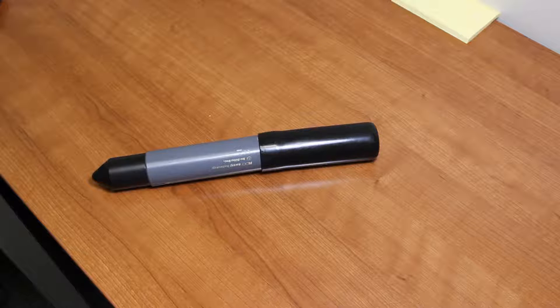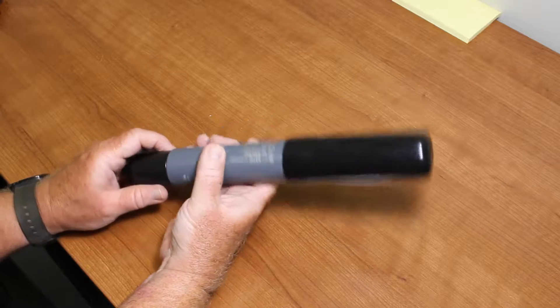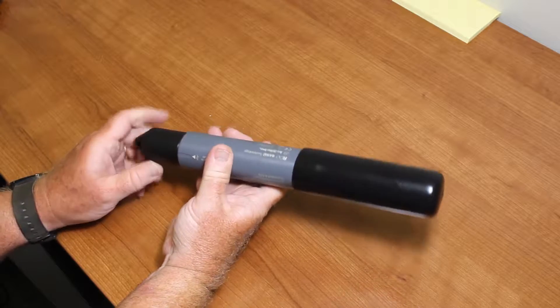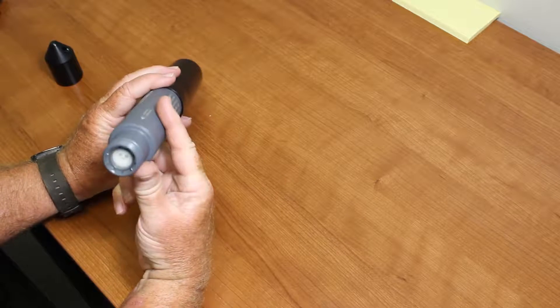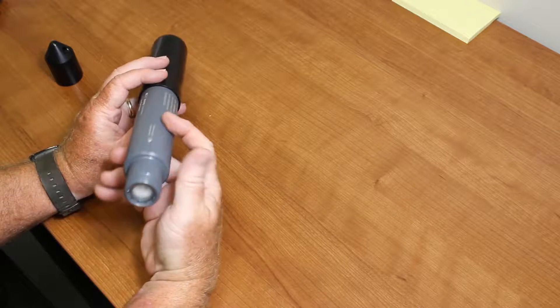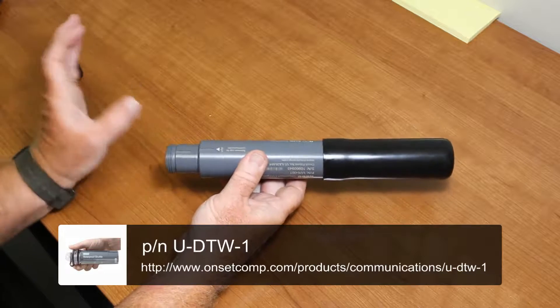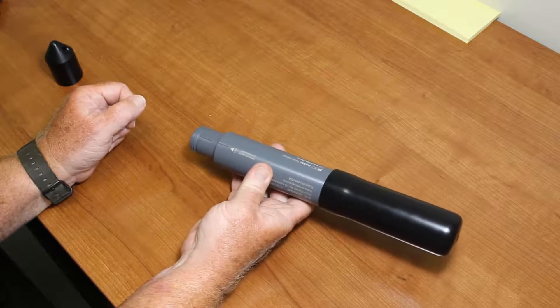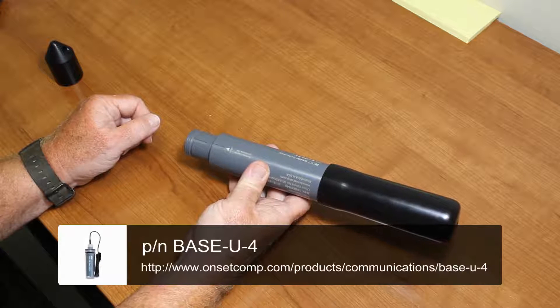The lab calibration routine is accessed with our HoboWare software — you can do it with the free version or HoboWare Pro. In order to communicate with this device, it uses low-power infrared LED communications, like most of our current water loggers. To access it with our base station or shuttle, we unscrew the protective cap. The infrared LEDs are inside — this is all waterproof, so you can offload data using the waterproof shuttle underwater. We're going to use the free version of HoboWare with the optic base station. To use the waterproof shuttle, you do need HoboWare Pro.